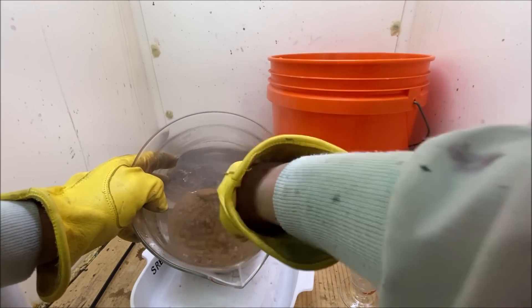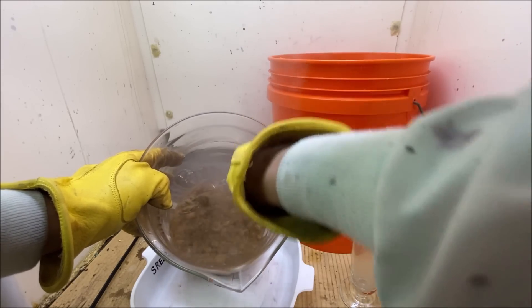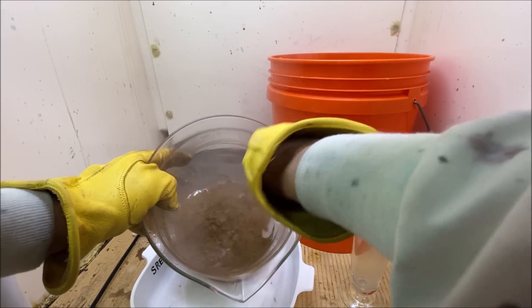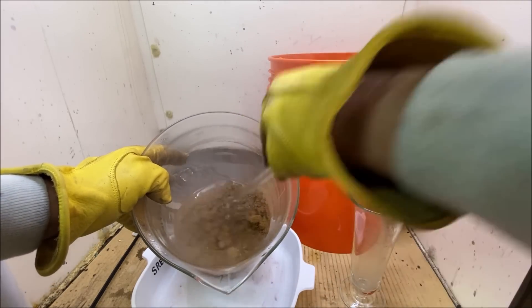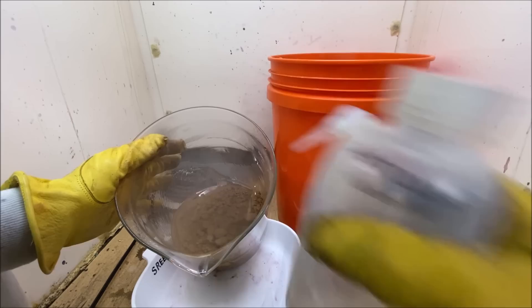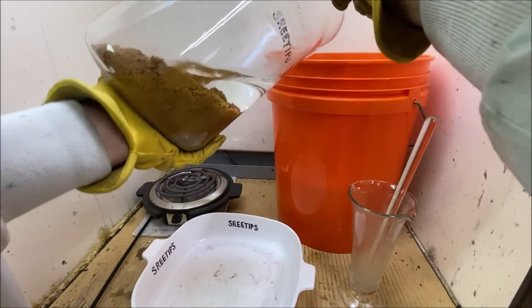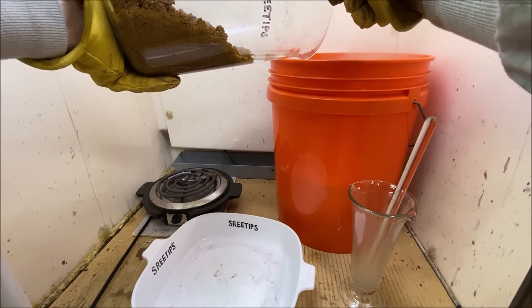I've rinsed it over and over with boiling tap water and I'm fairly certain we've got all the chemicals rinsed off. It's rinsing up real nice, staying clumped together like clean gold tends to do. I'll give it a little smell — no, I don't smell any SO2 fumes, so I think we've got all the chemicals rinsed off now.